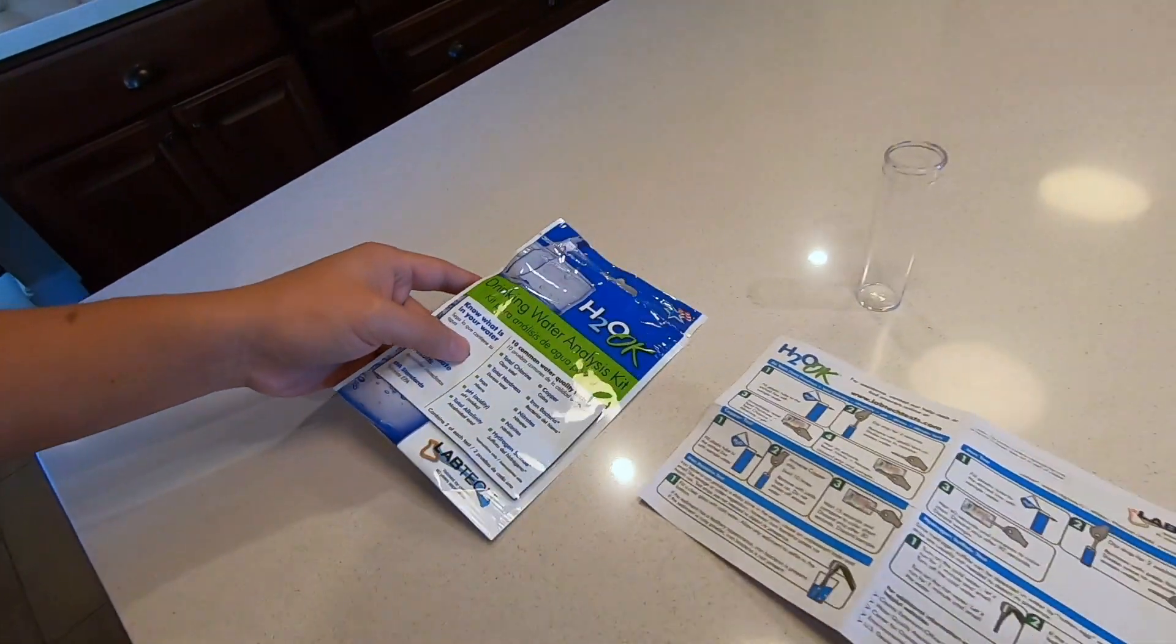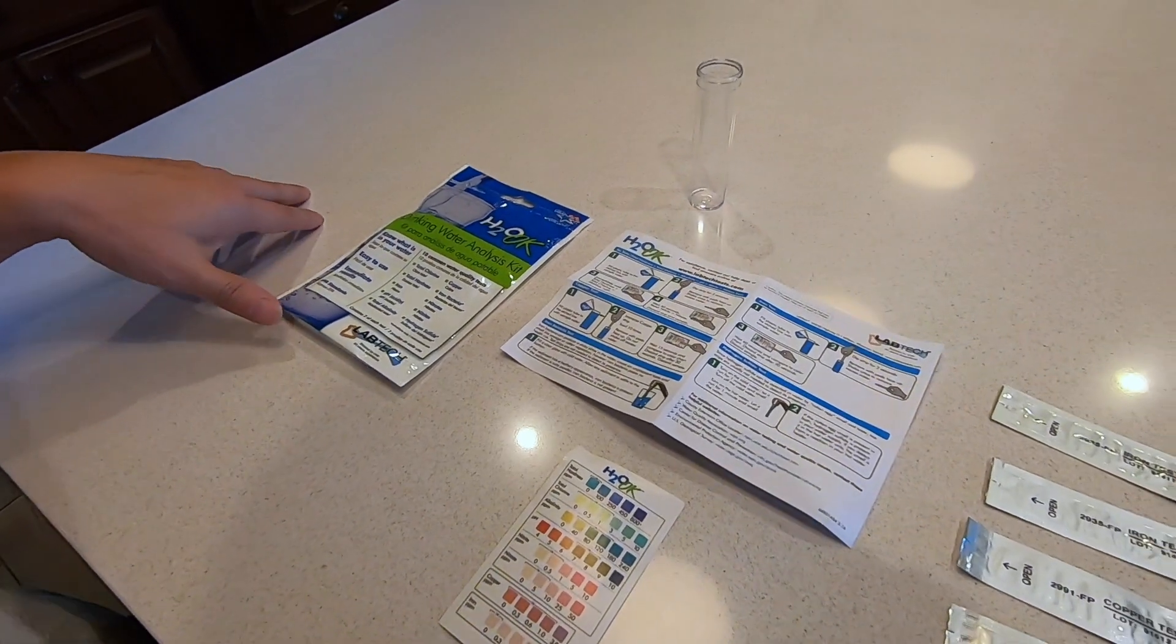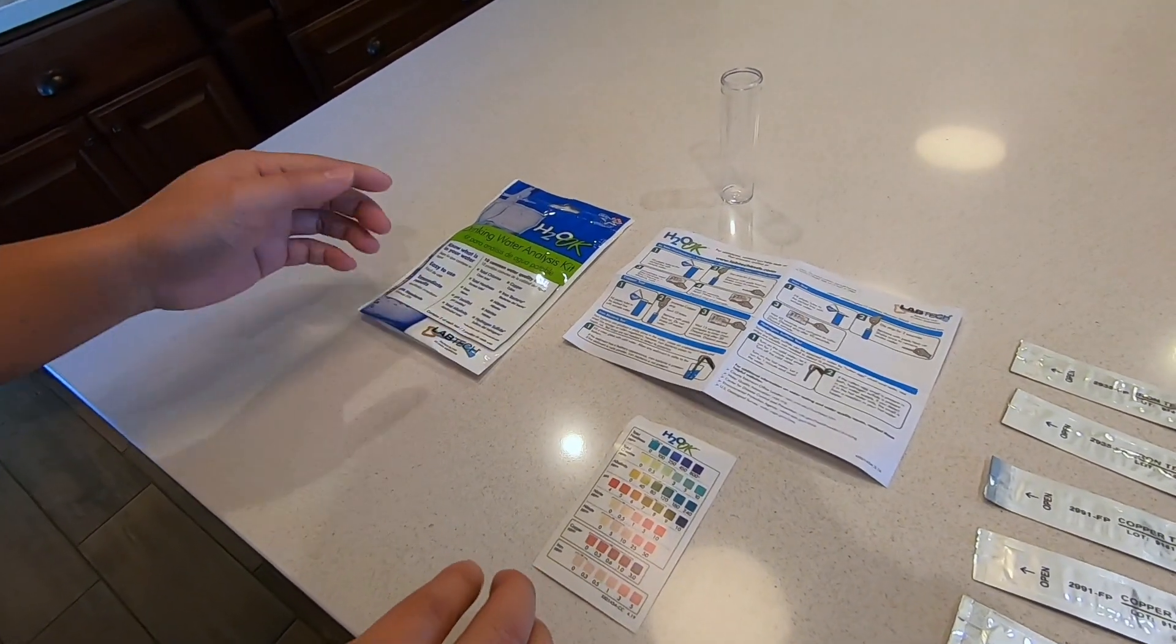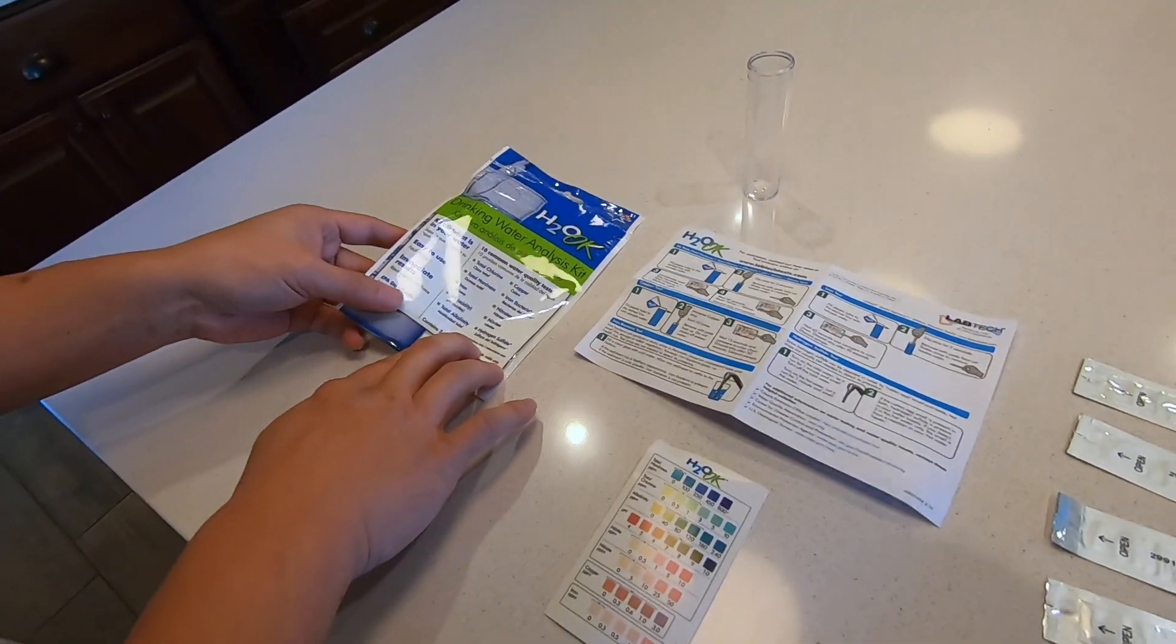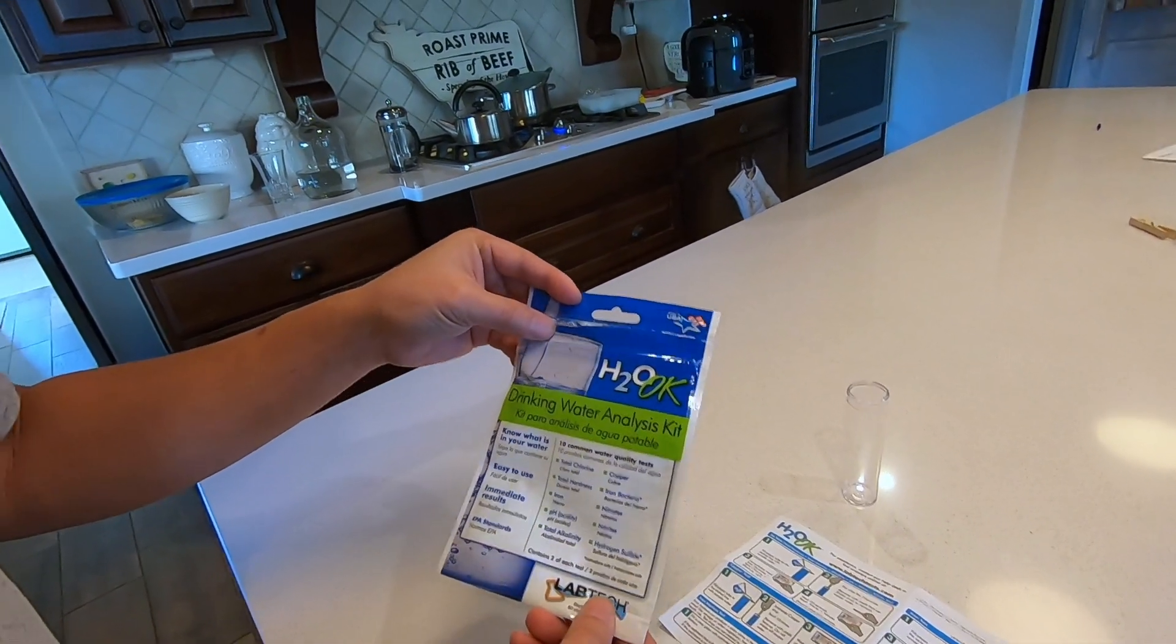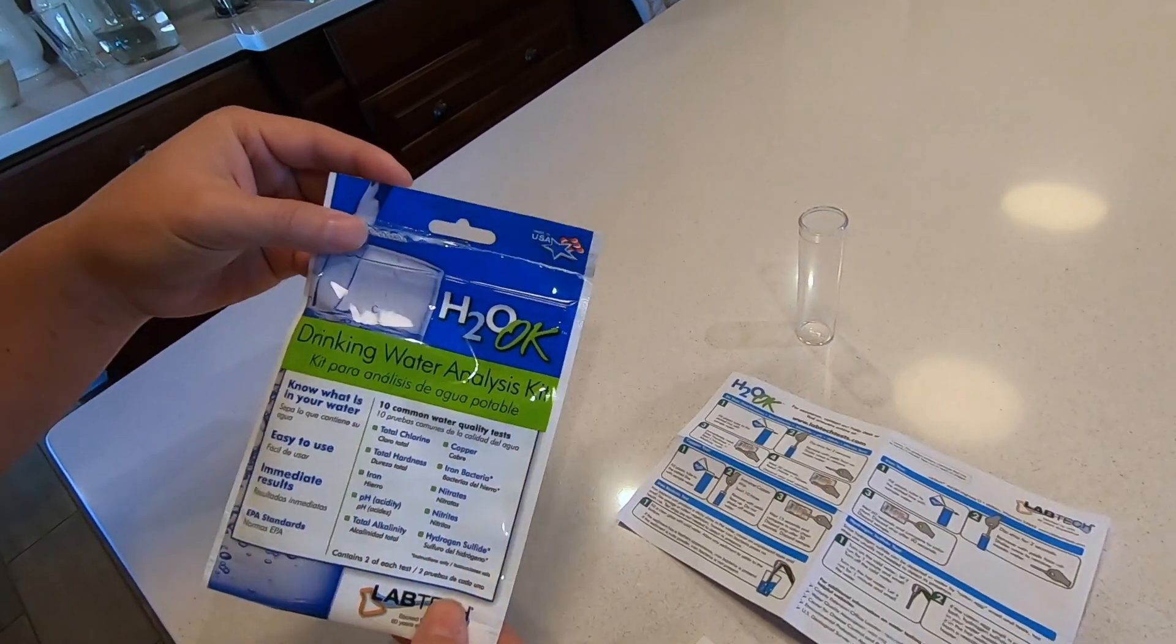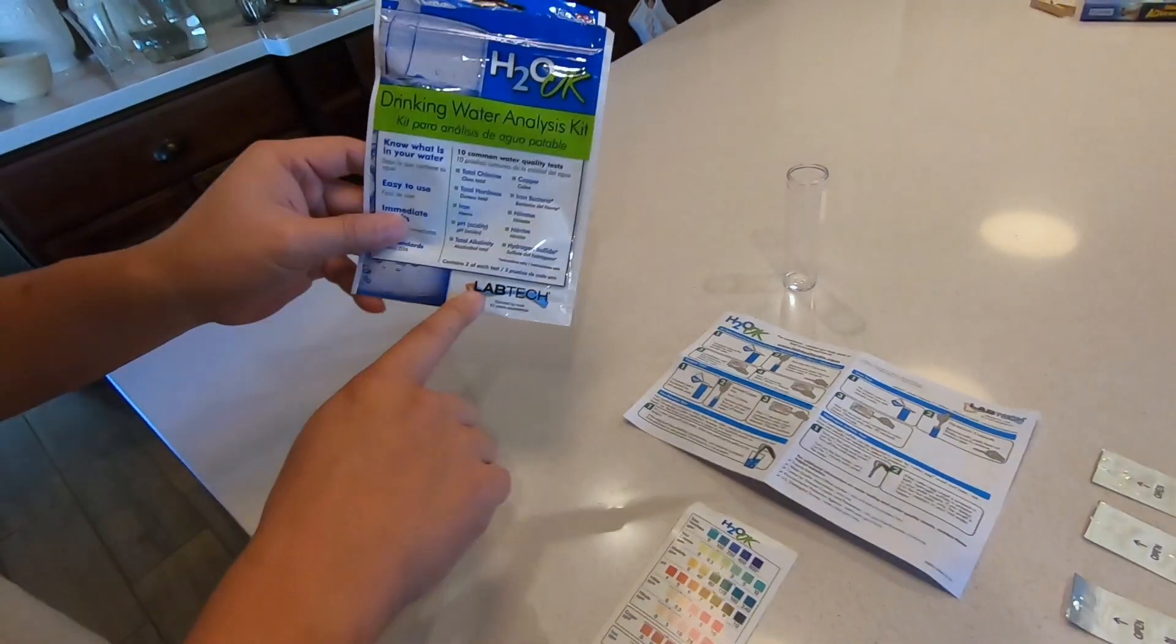We've been looking to see which water testing kit is appropriate and we saw a lot of water testing kits online. Some of them are $30, $20, but we actually found one that is being sold at Lowe's. This is one of them right here, called H2O OK, about $10, made by Labtech.